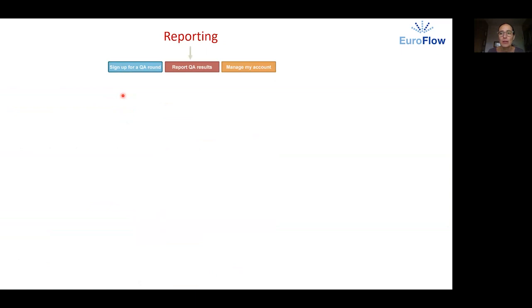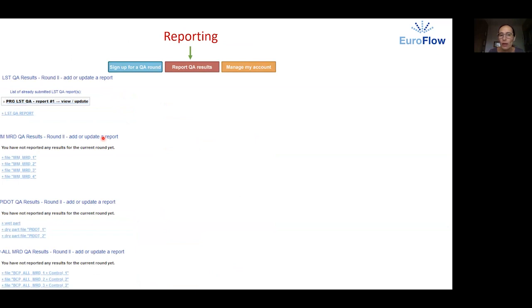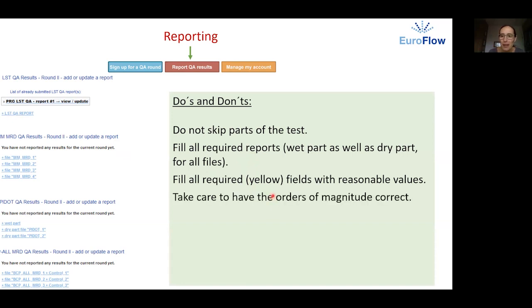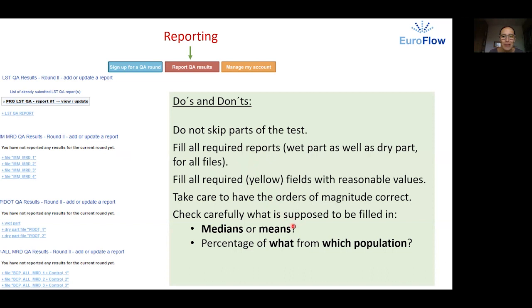To report your results you select the report QA results link and you will get to this page. So here are some do's and don'ts. Do not skip parts of the test. Fill all required reports wet part as well as dry part and for all files. Fill all required yellow marked fields with reasonable values. Take care to have the orders of magnitude correct. Check carefully what is supposed to be filled in for example medians or means percentage of what from which population. After the report is filled you can print it and check it. If anything is wrong don't panic you can update it.